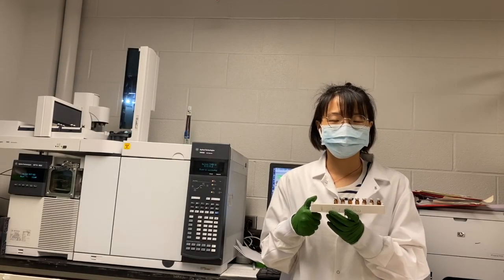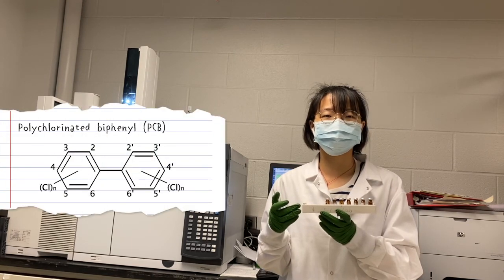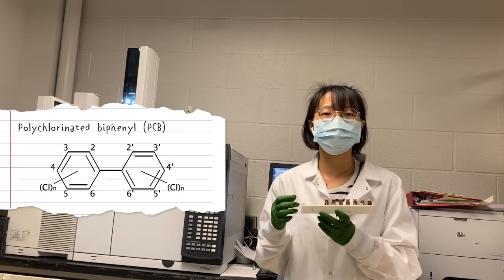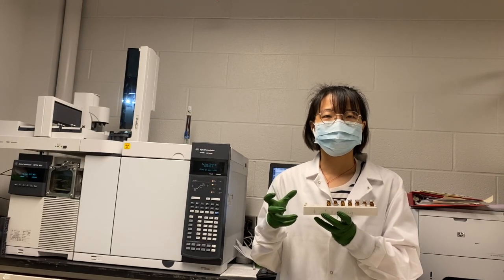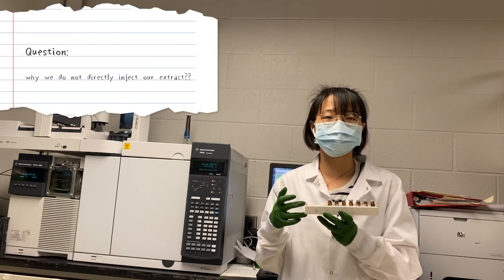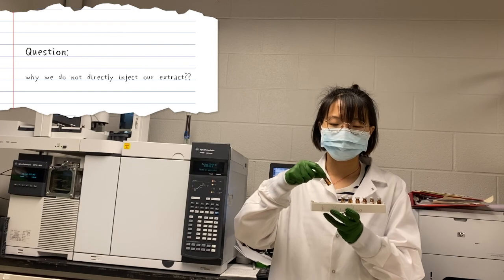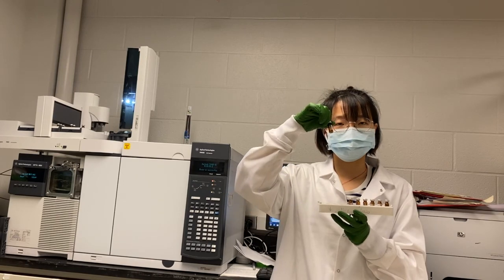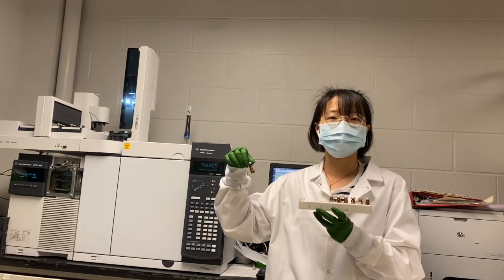I'm a PhD student at the University of Maryland, and I studied the concentration of polychlorinated biphenyls in stormwater sediments. I collected stormwater sediments in urban areas and used microwave extraction to extract PCBs from the sediment samples. And in order to get rid of the other compounds besides PCBs, I used alumina to clean up the samples. And then I used hexane to wash the PCBs out from the alumina column. Here, PCB extracts were dissolved in hexane, and I'm going to inject this sample into GC to quantify the PCBs.